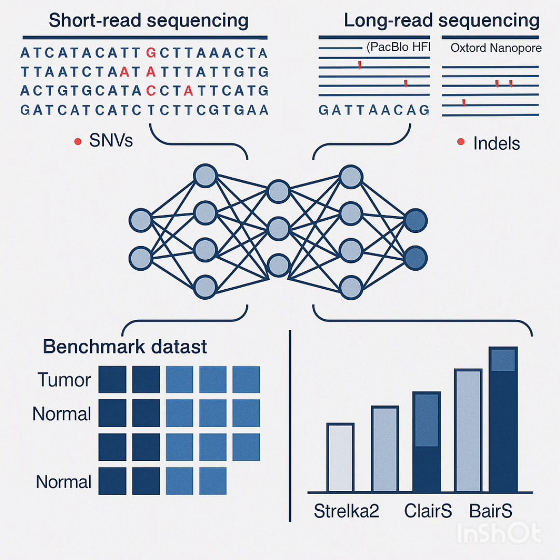It sounds like the ultimate signal-to-noise problem. It really is. You've got these somatic variants, often at really low frequencies, swimming in a sea of normal DNA you inherited. If you miss them, or worse, misclassify something normal as cancerous, well, the treatment decisions can go completely wrong. Okay, so our mission for this deep dive is to explore this pretty interesting new tool called DeepSomatic.